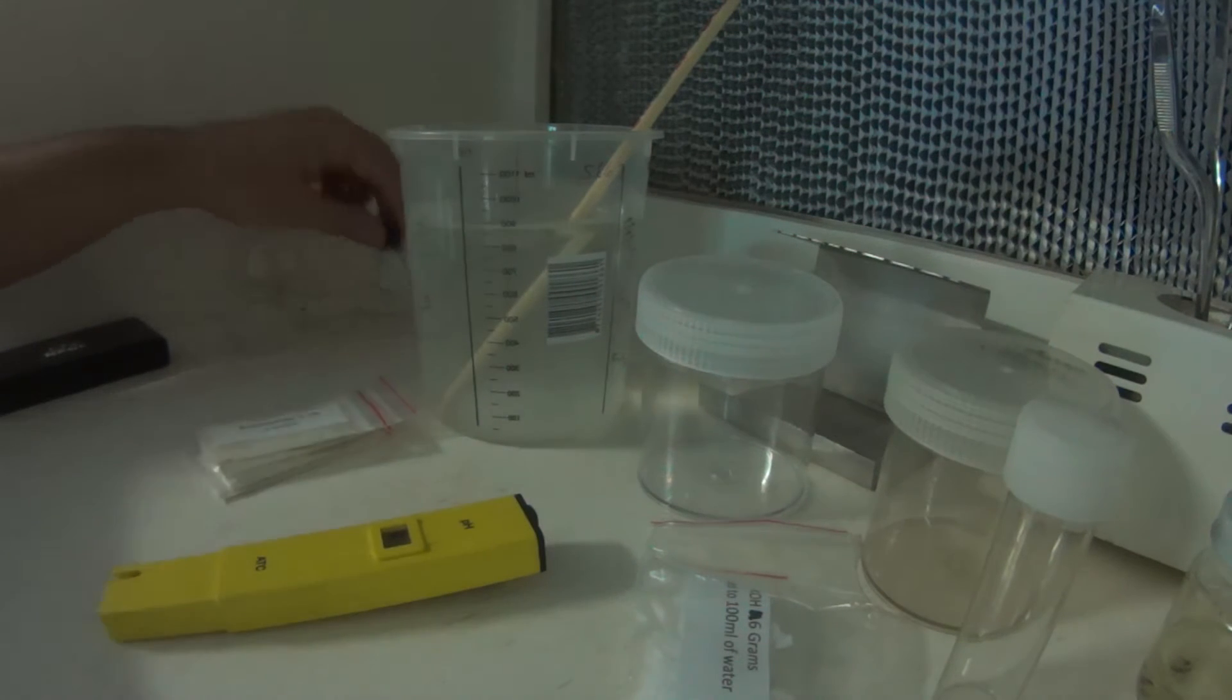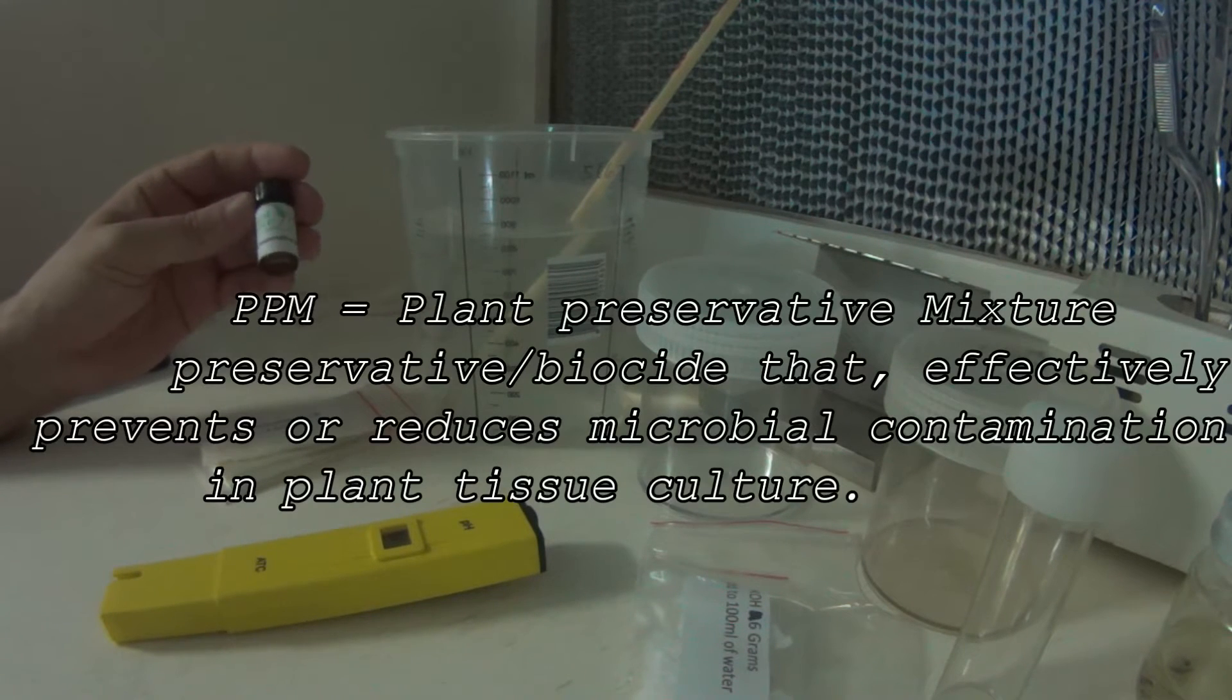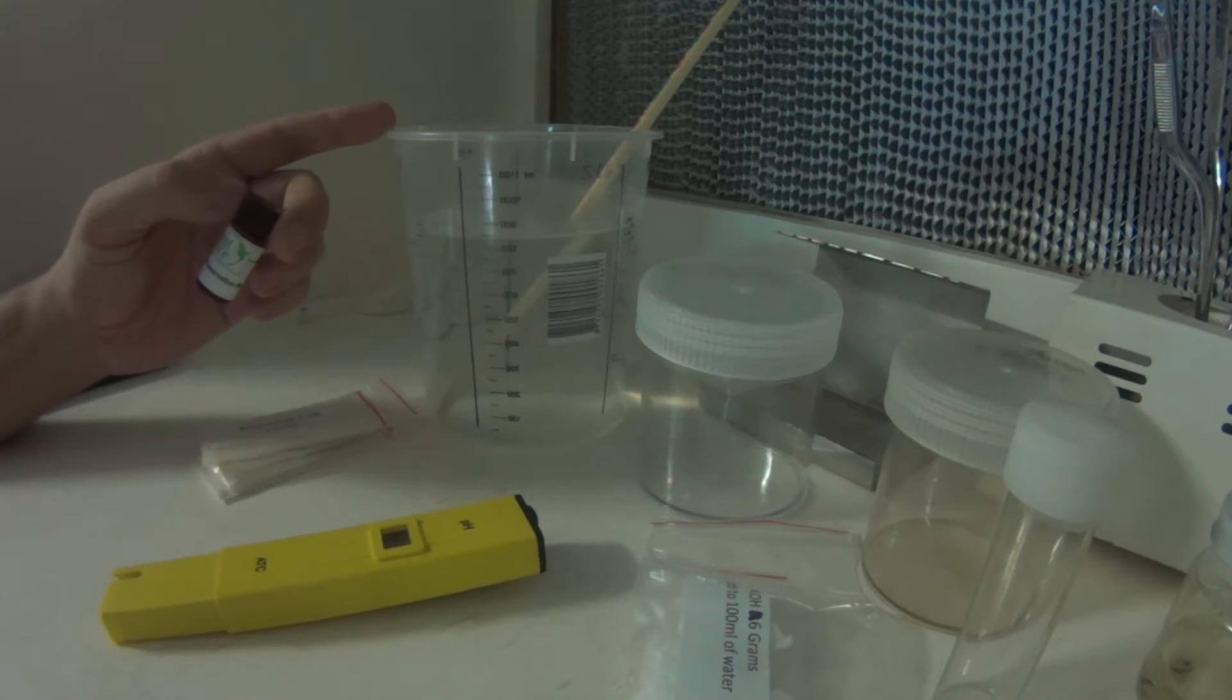One of the important ingredients, well, additives we can use in our media is plant preservative mixture and we supply within the kit a 5ml bottle. I only use about half a ml per liter of media. If you think you're going to have a problem with contamination in your media, you could also use a ml, increase that to a ml I mean.